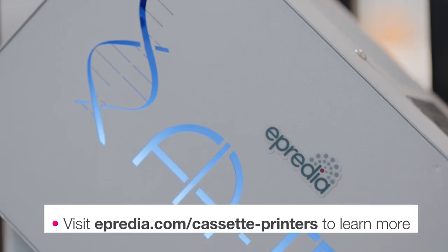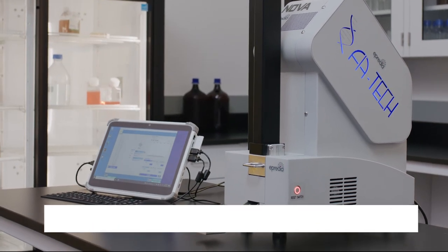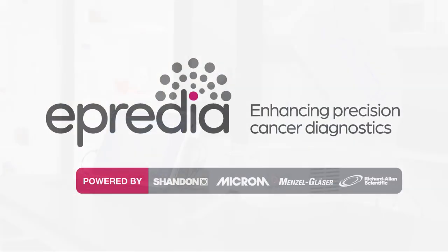For more information or to schedule a demo in your lab, go to epredia.com/cassette-printers and select request more information.